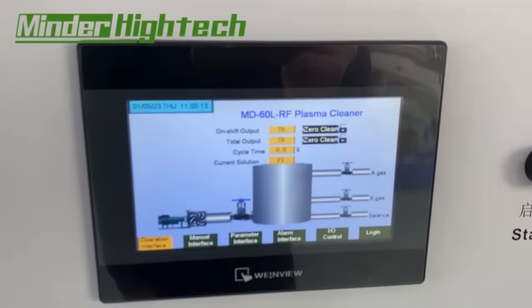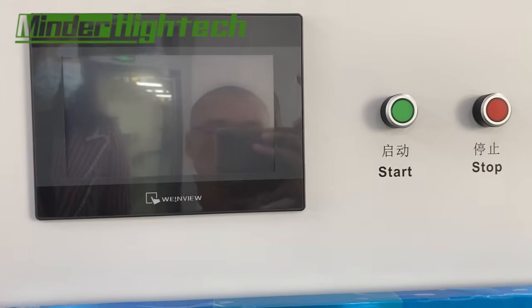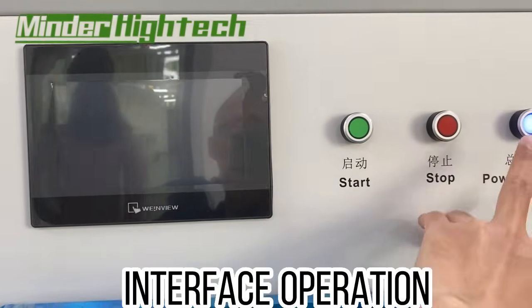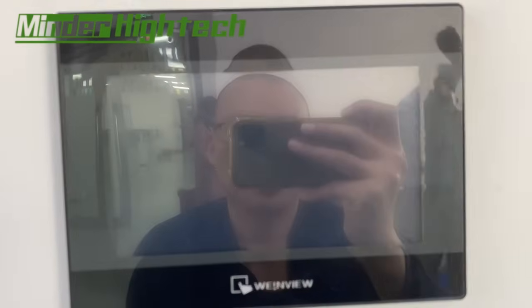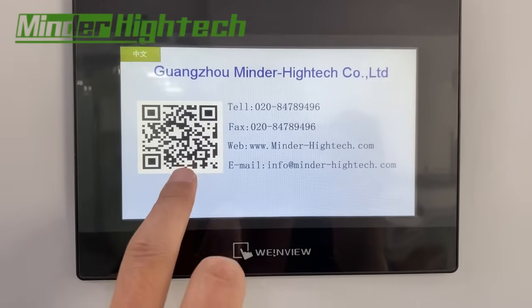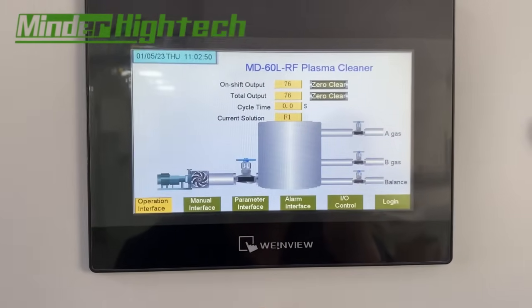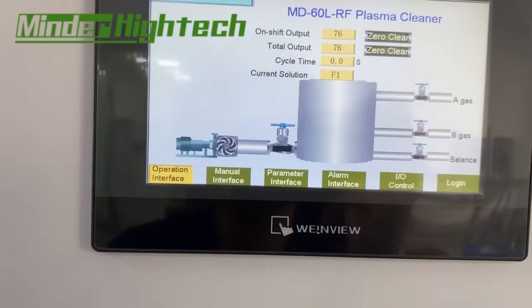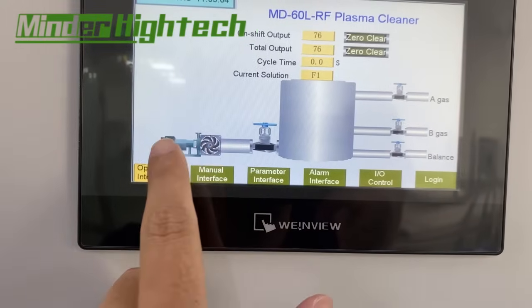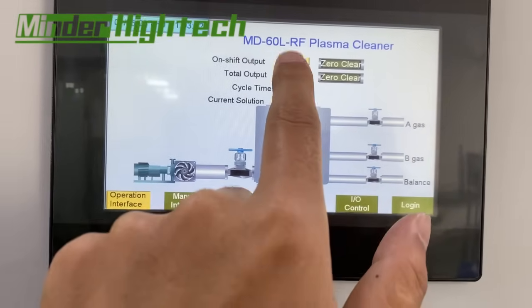Let's see how to use the interface. When we power on the power switch, you will see the touch screen. This is our company information — there is a Chinese version and an English version. Press anywhere to go inside. The interface is very easy to use. This is the operation interface where you can see the vacuum, gas, cavity, and working status — these values cannot be changed here.